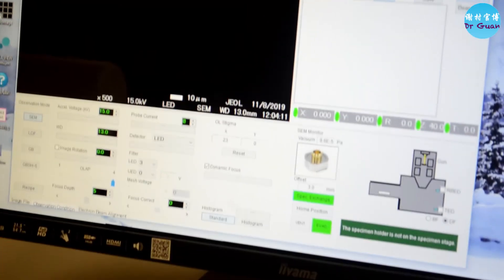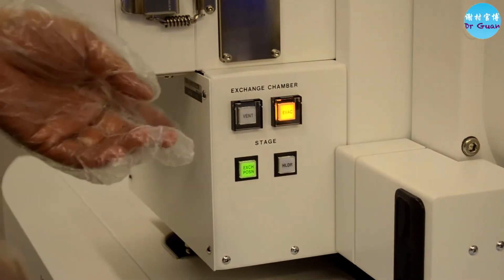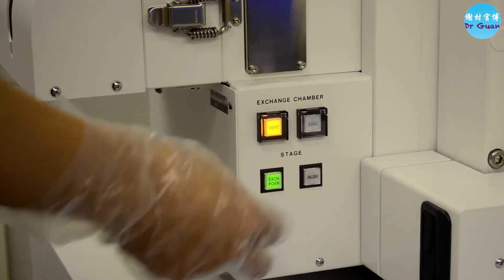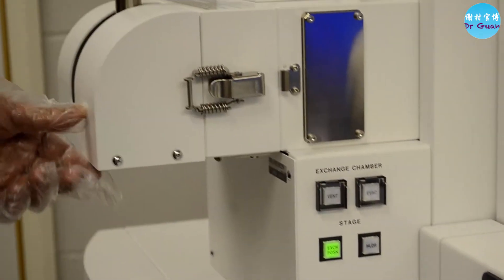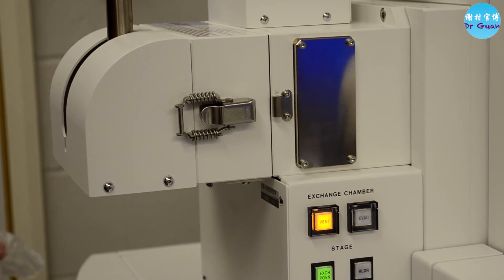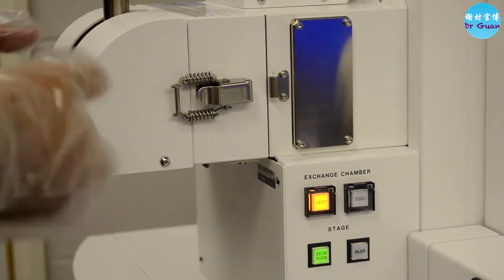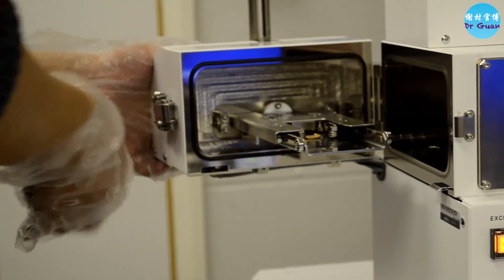Now we need to vent the system. There are two ways to do this: you can either click the vent button in the software and press OK, or you can use the button on the SEM chamber. Press and hold it until it flashes, then release the clamp — it will now start venting. The advantage of this exchange chamber is that both venting and pump-down are very fast. When it stops flashing, you can open the chamber — that's the specimen exchange system.